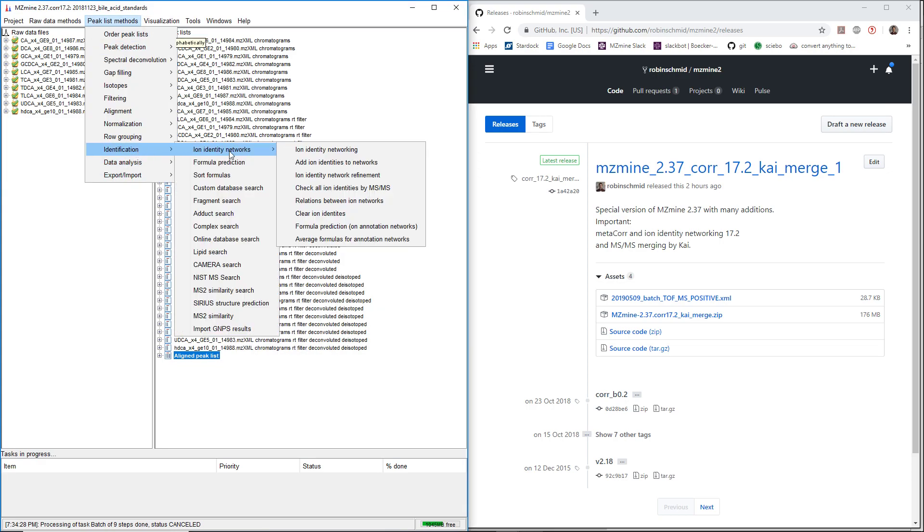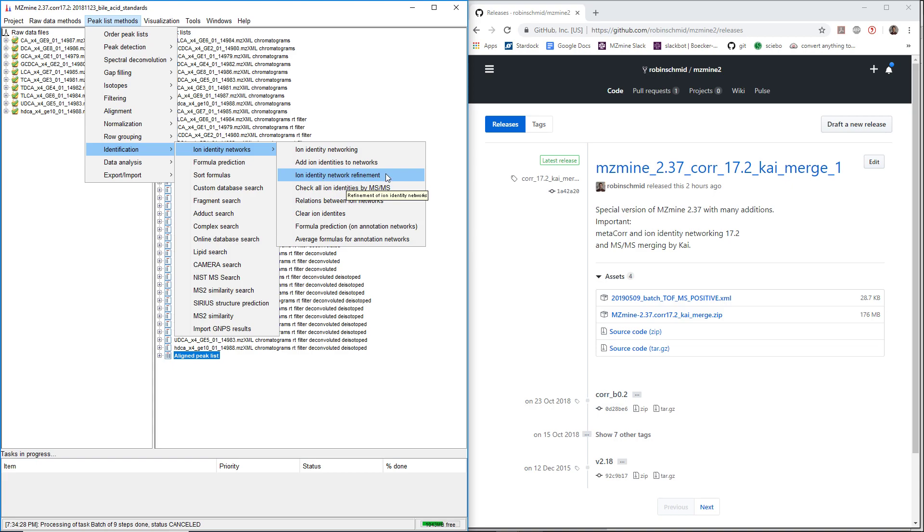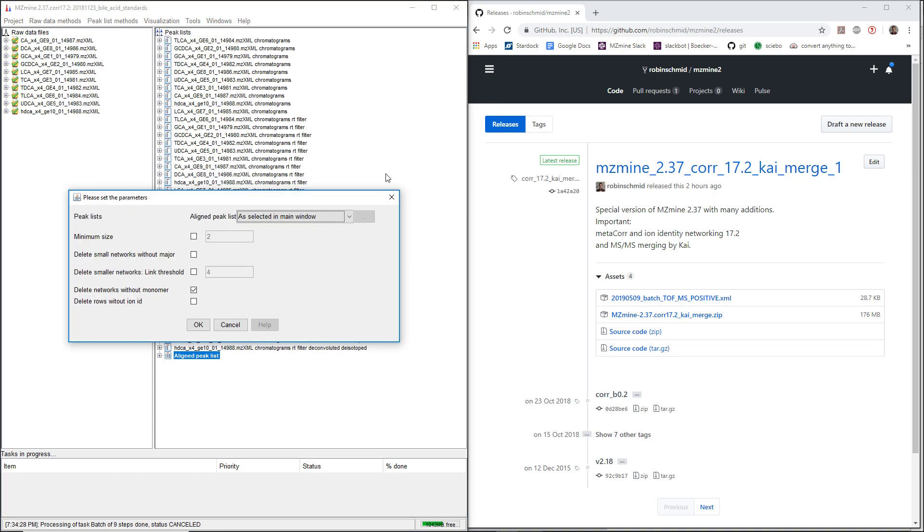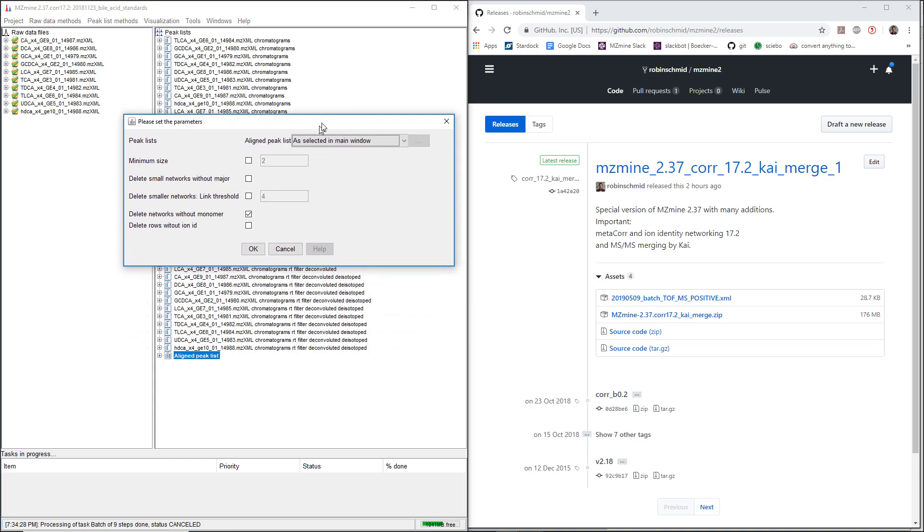Then we always have the ion identity network refinement. The refinement is very important to just, after we create networks, re-evaluate how good they are.